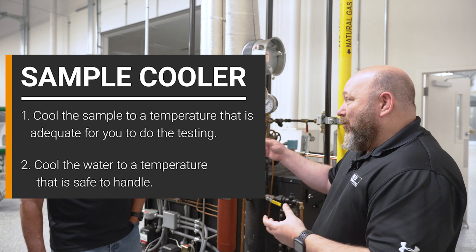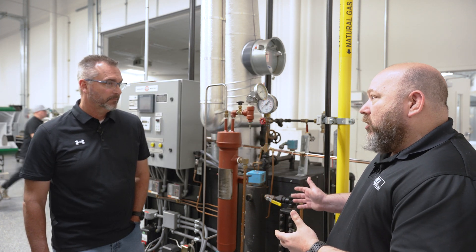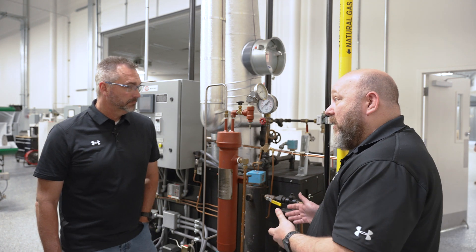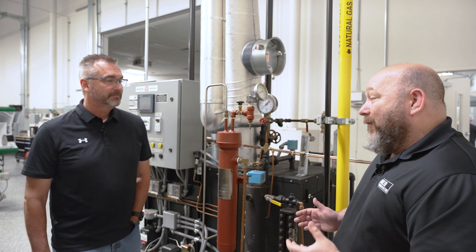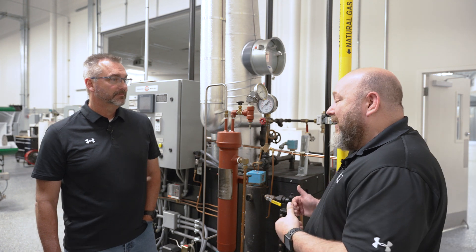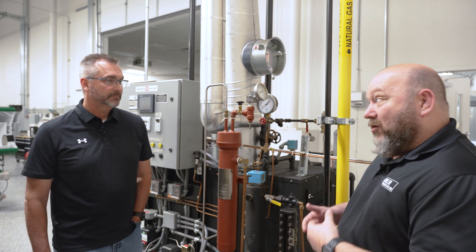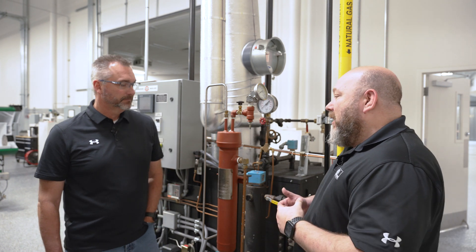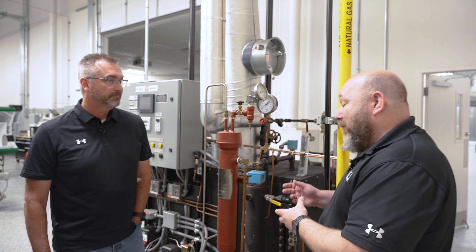Especially for test tubes and things like that — you don't want it over temperature. These boilers, a 100 PSI boiler runs at 338 degrees. That's very hot. Even when that condenses into water, it's still over 212 degrees. You want to make sure that sample is cool enough for you to be able to handle.